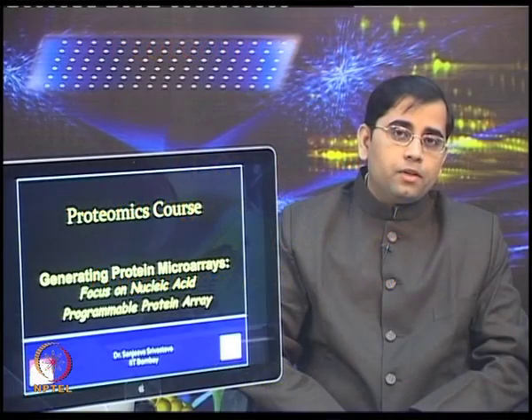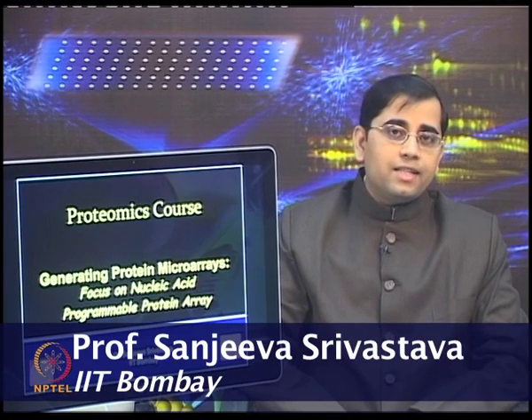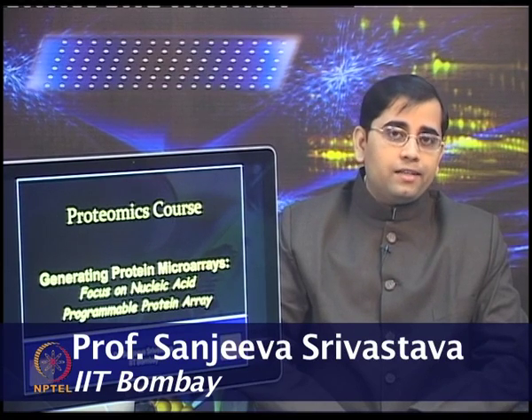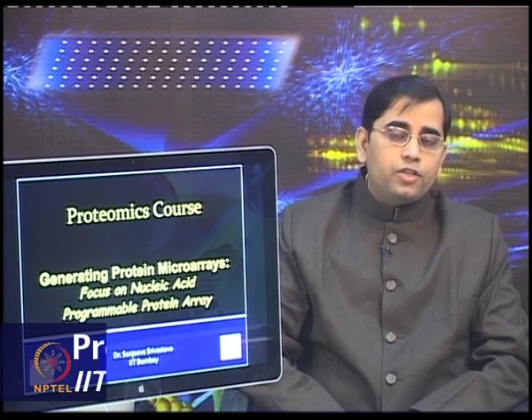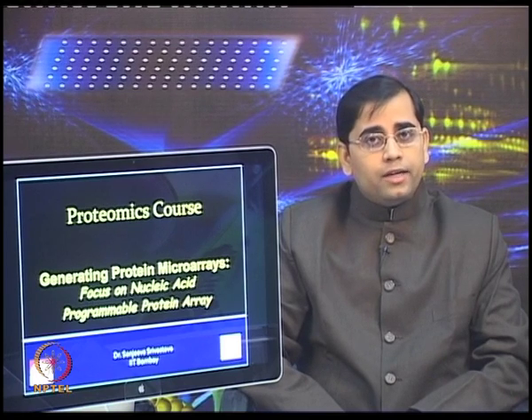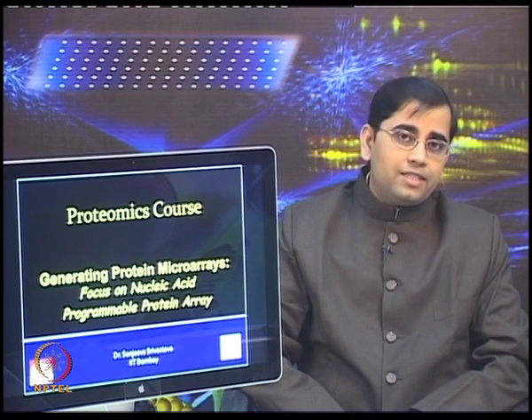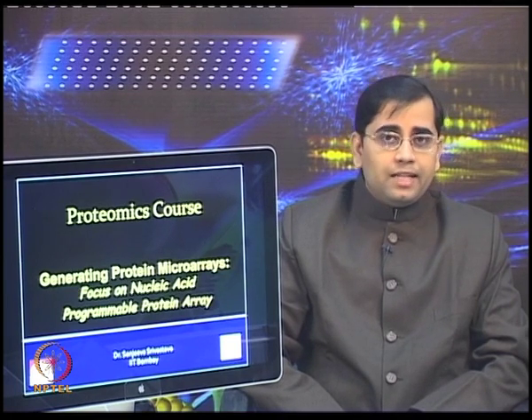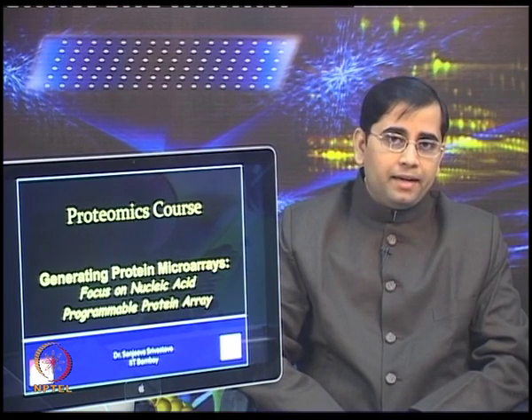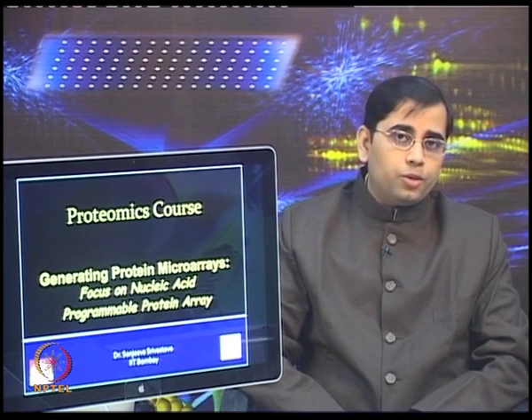So, as you know, the microarrays provide a high throughput versatile platform for large scale analysis of functional proteins. The traditional cell based expression methods which have been used for protein microarrays generate proteins in a heterologous system such as Escherichia coli. But there are several challenges posed by these systems for protein purification, as well as maintaining the protein integrity and functionality, and protein storage. All these pose several challenges.